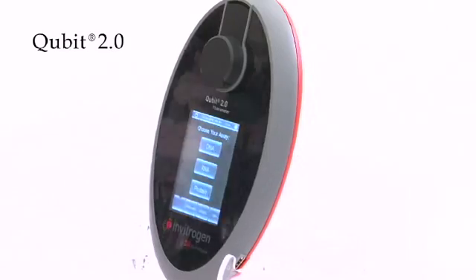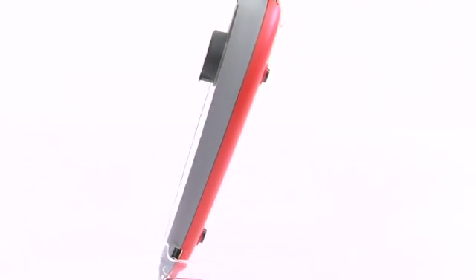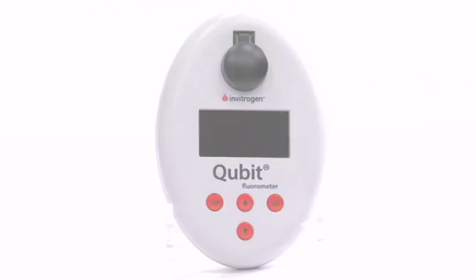It's hard to believe how something so simple, so light, can deliver such performance. That is exactly what Qubit 2 does. Qubit was a real revolution when we launched version 1 in 2006. We learned so much from the scientists. We listened to their suggestions and we brought them into version 2. With Qubit 2, you don't need to change yourself to fit the device. It fits you.